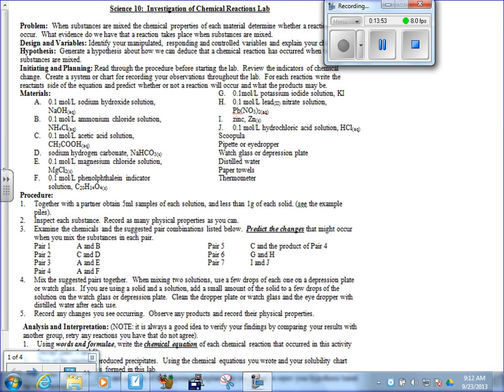For everything else, I have even gone as far as to write on the eyedropper what stuff it goes in. It is that important that you do not bring the wrong eyedropper back and put it in another one. We're trying to make chemical reactions happen. I don't want the reaction happening in the sample, because it takes a long time to make these samples up, and I don't want to have to make them up again.